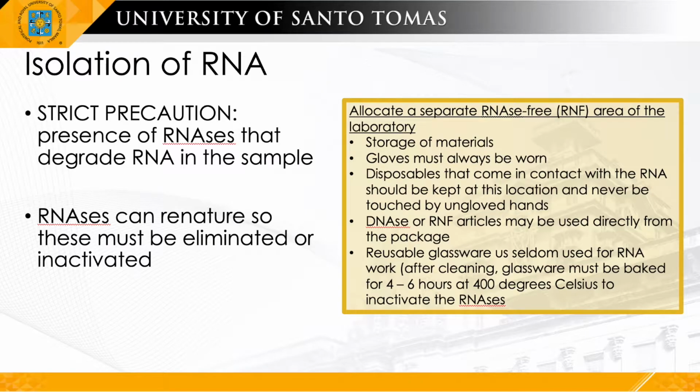One of the strategies is you need to allocate a separate RNase-free or RNF area of the laboratory. The DNA area and the RNA area should be separate; there should be two, a division of that. There should be a storage of materials. Gloves must always be worn in there. Disposables that come in contact with the RNA should be kept at this location and never be touched by ungloved hands.